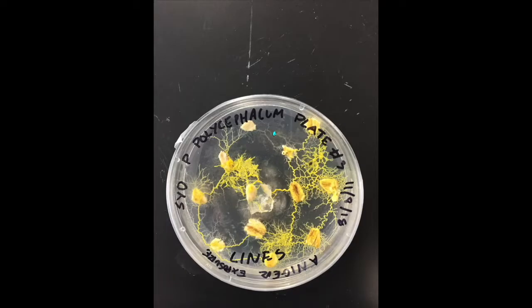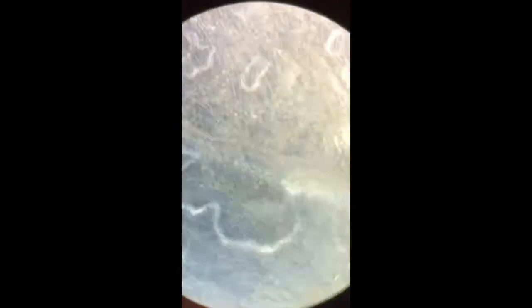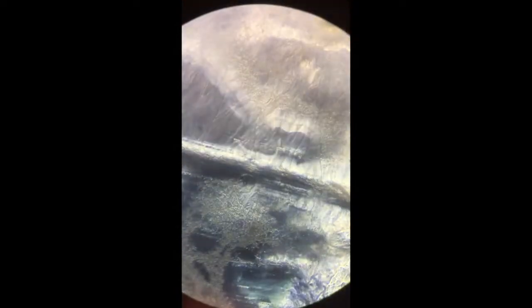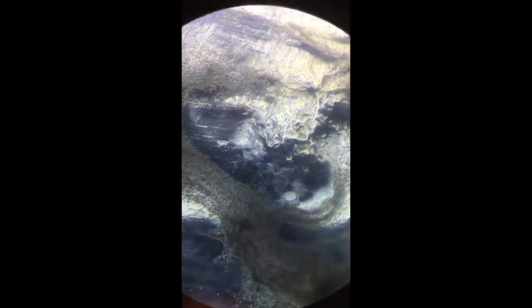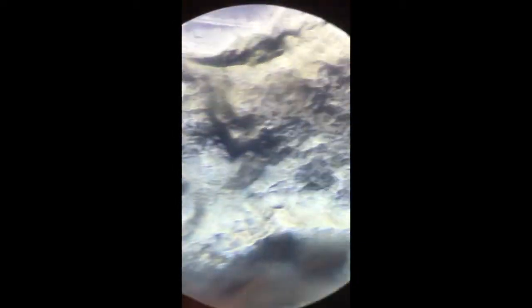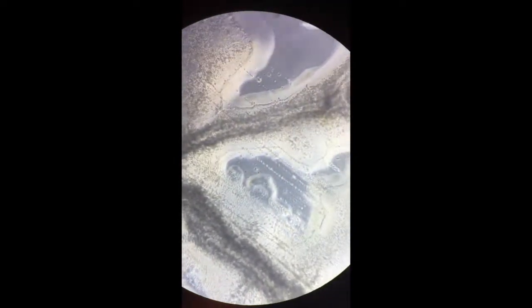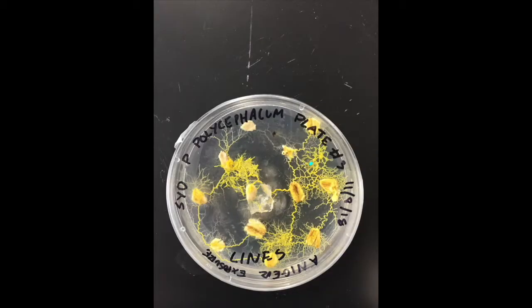By hour 72, you can see the leftmost point is again totally empty of slime mold, just the residue. I'm not sure that it had the same effect as the intersections one where it used the slime mold to transport its spores, because these don't necessarily look as opaque as the last ones, though they do seem to have some black spots in them. So it's possible that that happened on this plate as well.